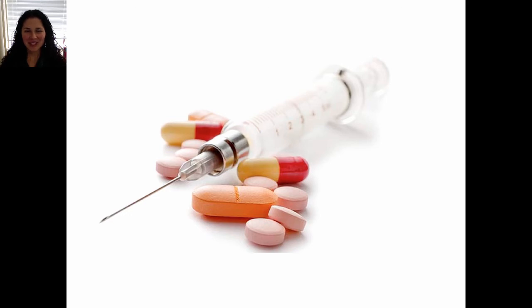Hi, this is a pre-lab video for carboxylic acids and their salts. This is really a lab about drug solubility. It's important to understand the solubility of acids and their conjugate bases so that when you inject a patient with medicine, the drug will still be soluble in their bloodstream.